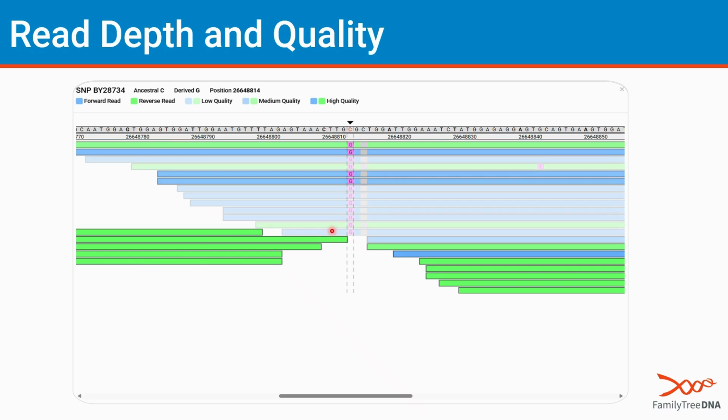Because sometimes, the sections of chromosomes can look somewhat similar to each other. It's sort of like if you're anything like me and you go on a hike in the woods and you don't bring your map because obviously maps and directions are beneath you and you don't need them, then you have a hard time sometimes seeing where you are. And you might think, hey, didn't we pass this tree already? Is this the same tree or is this different? Well, this is telling you that we're not quite as confident. So we did get some good reads, but you can see here that a lot of them weren't confident, so this is something that's taken into account when calling this. But whether or not you're called for a SNP, you can always look it up by the location.